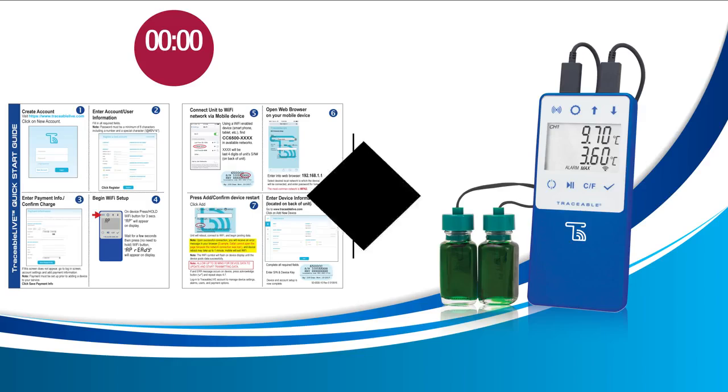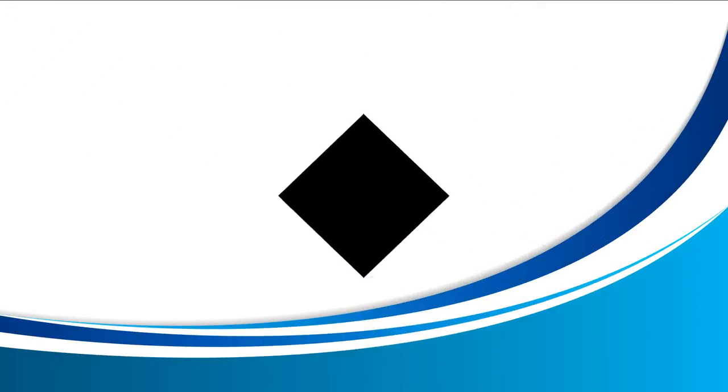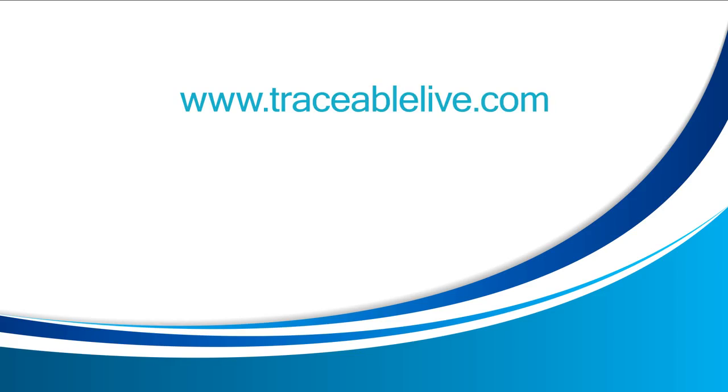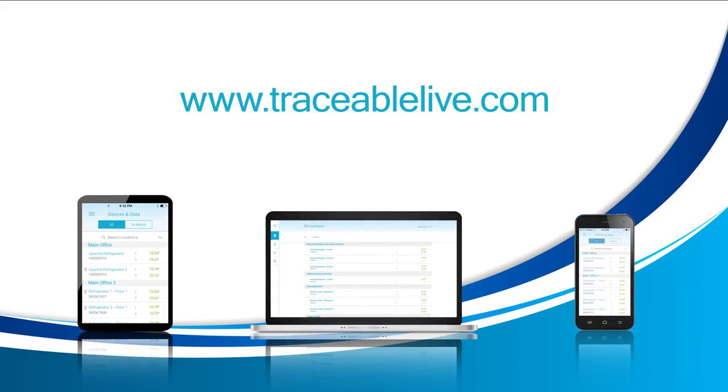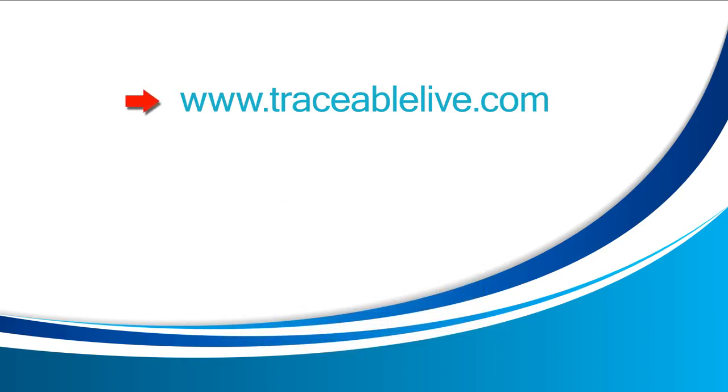Let's get started. Step 1. Create account. For this step, we'll first need to create an account at www.traceablelive.com. This can be done on any browser, on any of your personal devices, but we recommend a computer as the keyboard will make typing much easier. With that in mind, go ahead and click on the link here. This will automatically direct you to TraceableLIVE.com. Once you're there, click on New Account.